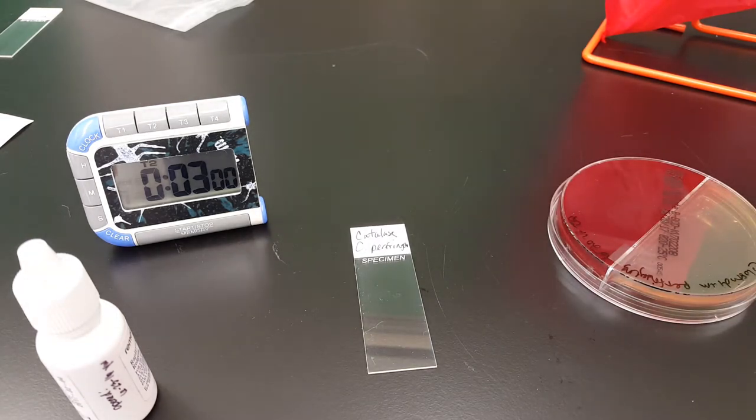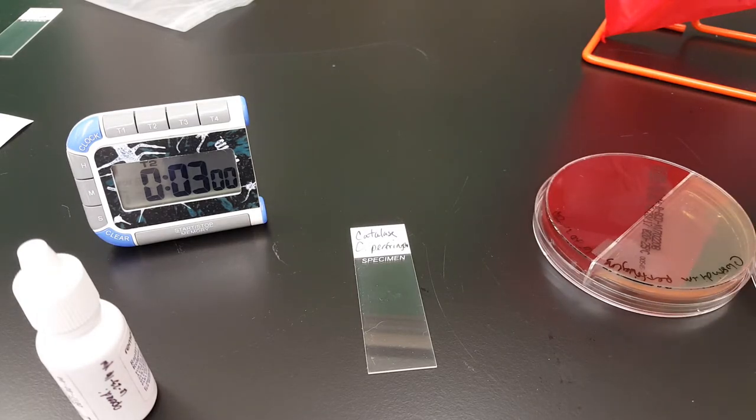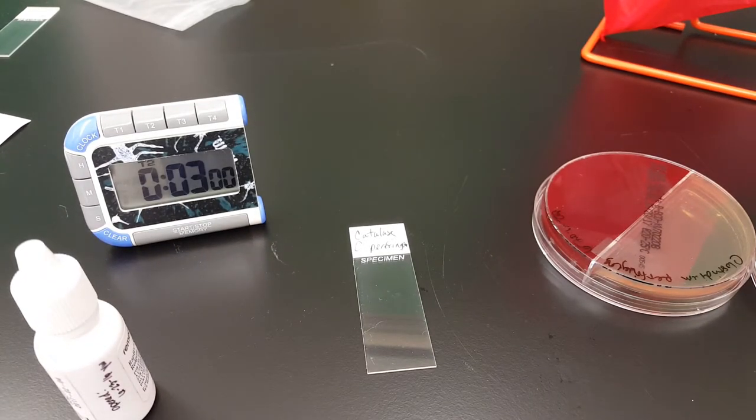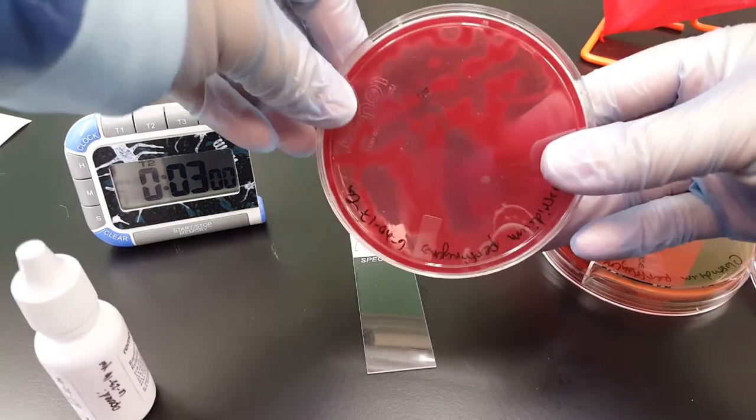They call it that it has a boxcar shape, and it's beta hemolytic on brucella blood agar plate, which is what we have here. So see all that?